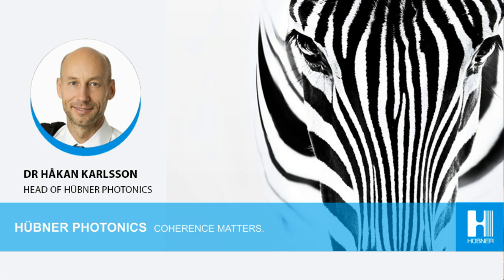For the diode pumped lasers, the separation between the longitudinal modes is much larger, which means that if you don't lock it onto one longitudinal mode, then the line width will be broader, and there will also be mode competition, which induces intensity noise in the output. So the short answer is all the diode pumped solid state lasers that we provide are single longitudinal mode.